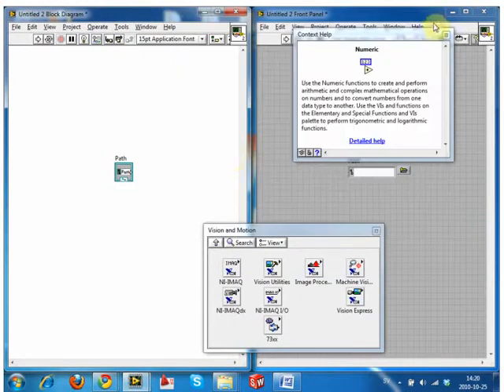But why are there so many functions missing? So with yours, you didn't install all the packages. I don't have the vision and motion, and okay, well you're fine. You have everything that you need, but it's just a little bit rearranged, but I have other packages for other things. So in yours, the only things that you really need for now are in this vision utilities. So they're all in here, image manipulation, files.